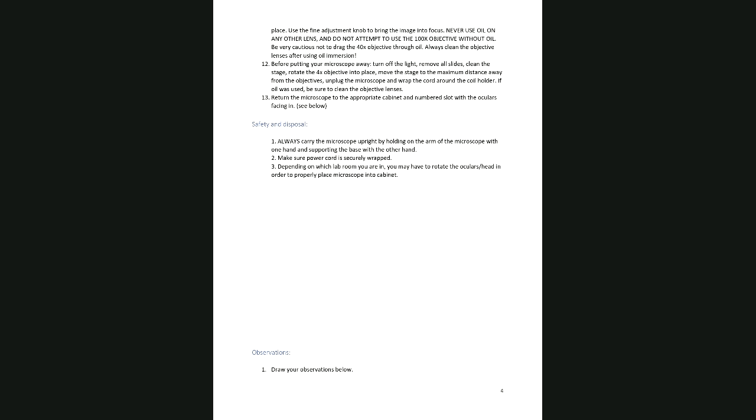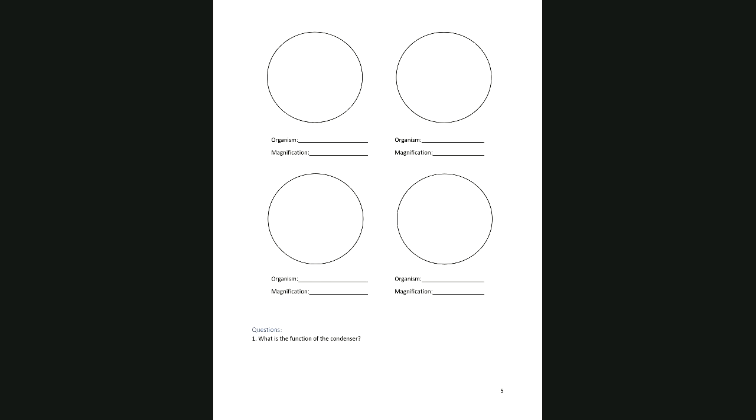So now there are no observations, because what we would normally do is just have you look at some of these slides, like the prepared slide of blood or paramecia, miscellaneous bacteria, and have you draw it, for example, under low power and then under high power or under oil, so you can see the difference and the reason why we need to use oil most of the time. But we're not going to do that.